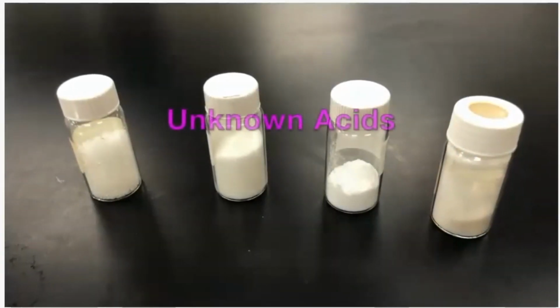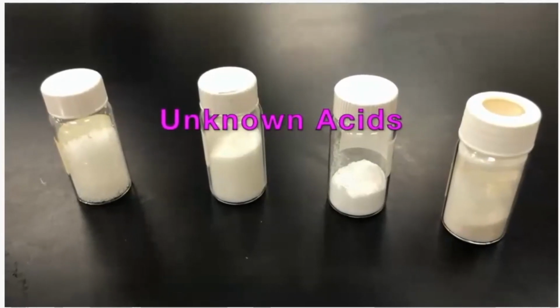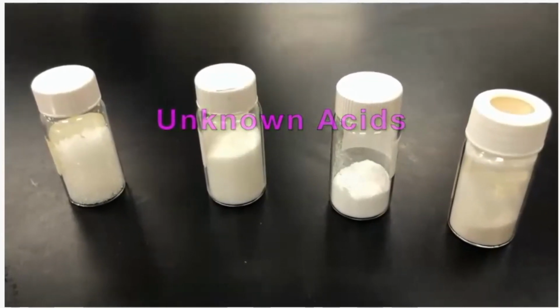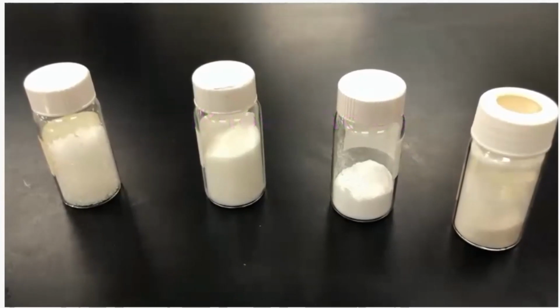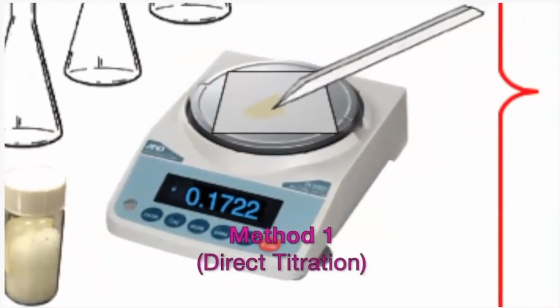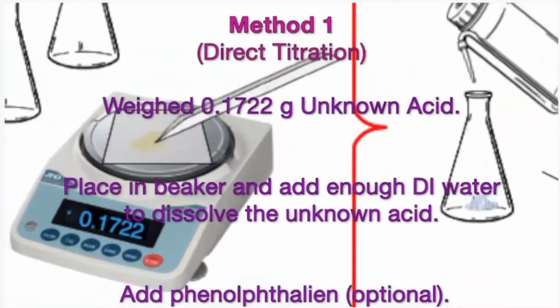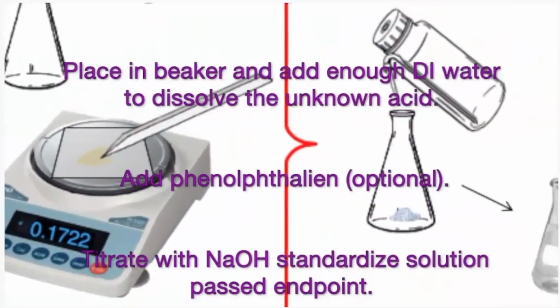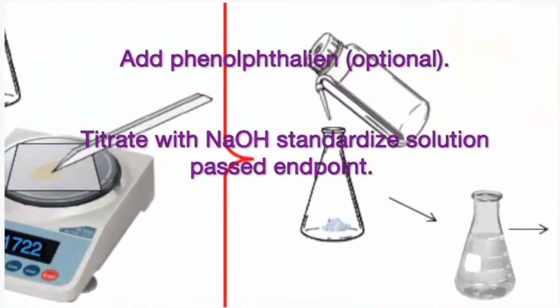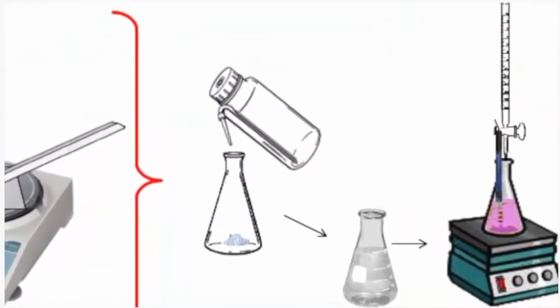These are your unknown acids. Take a look at the texture. They're all white. This is the mass that you guys are weighing. Method 1, direct titration, weigh about 0.1722 grams of unknown acid. Place in beaker, add enough water to dissolve the unknown. Add phenolphthalein, optional. You don't need to do that because you're doing a pH, and then titrate it to the equivalence point.